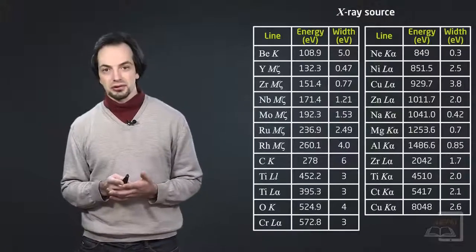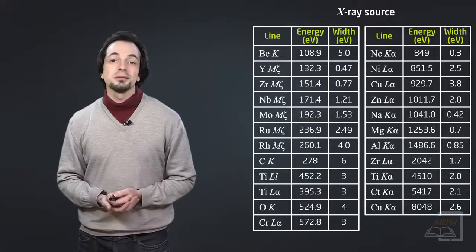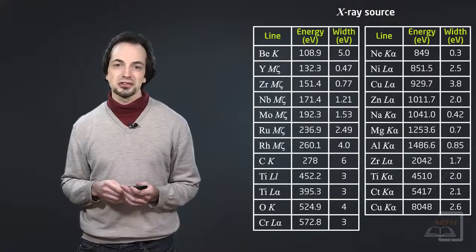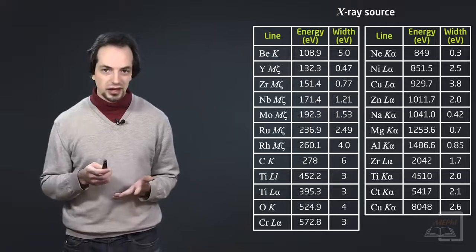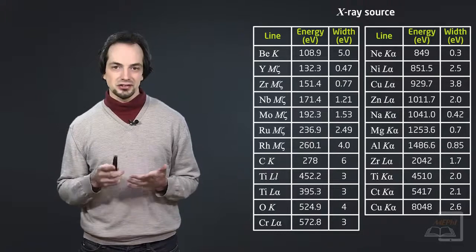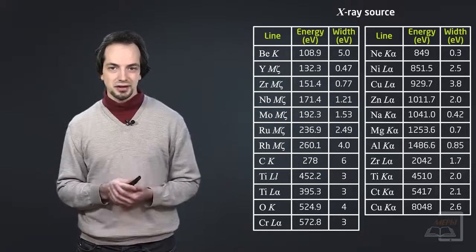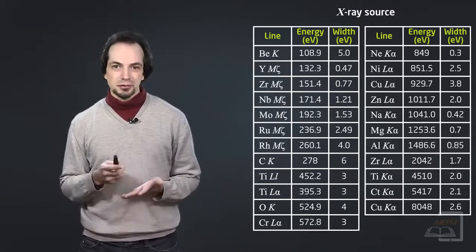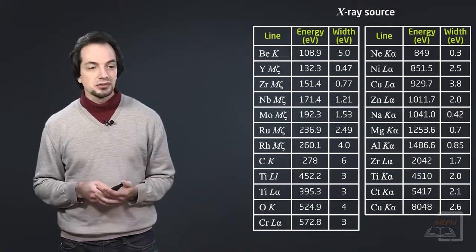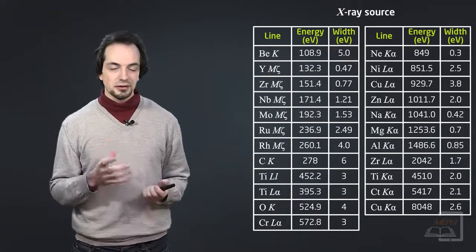So you need an X-ray source, a monochromatic X-ray source. We already know how this might be obtained. Monochromatic X-ray lines occur when characteristic X-ray irradiation is induced. We know that from the EDS method, because characteristic X-ray irradiation is almost monochromatic. It corresponds to certain energy levels. You must remember those peak structures. So we can look at the peaks from different elements, at their width, at their number, and so on.